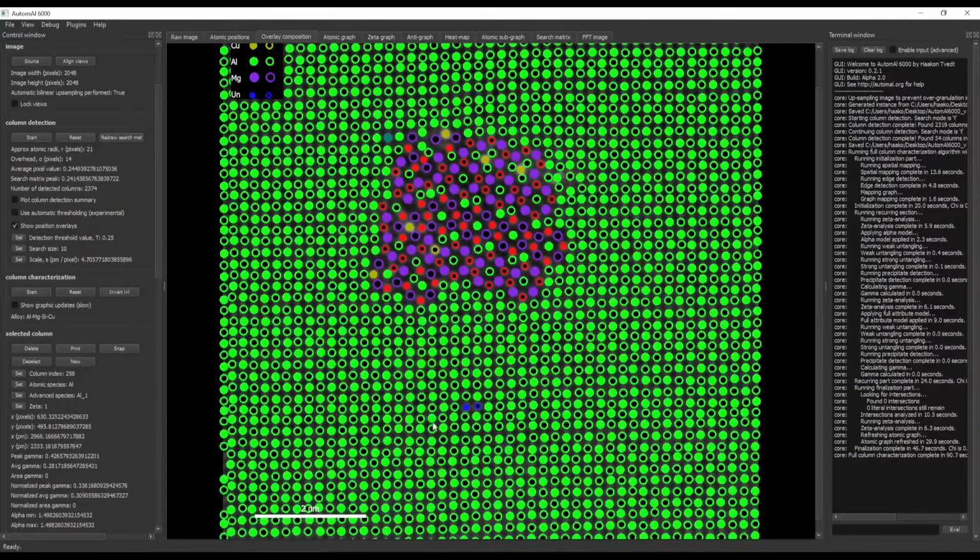So we see in the matrix, it looks like they got all the heights correct, and I believe it is fairly correct here too. And yeah, so this is a good result, but it will never do a perfect job, so you have to help it from this stage.